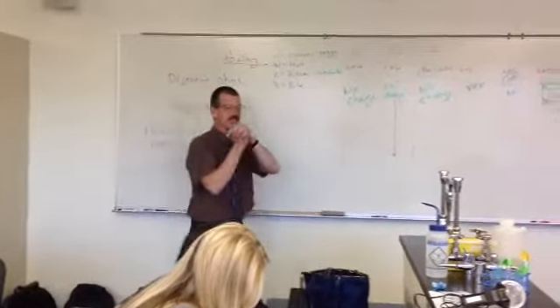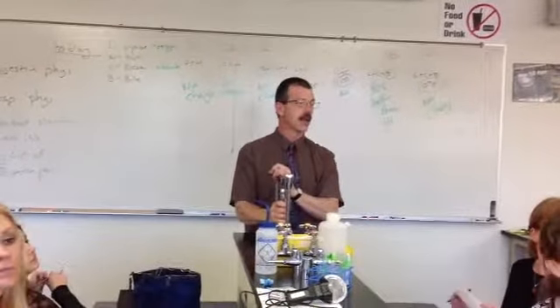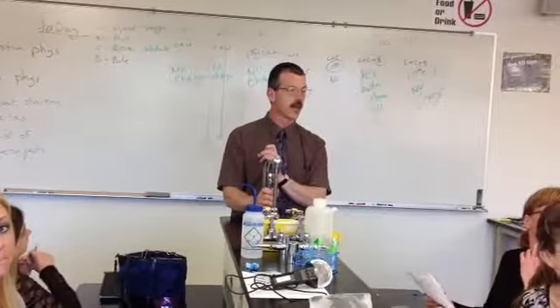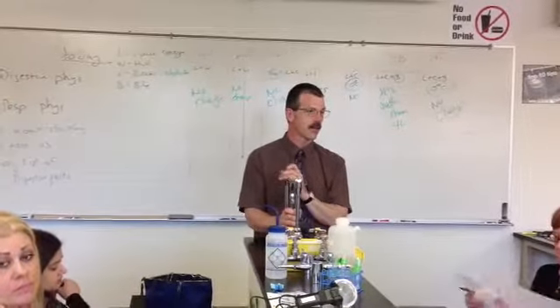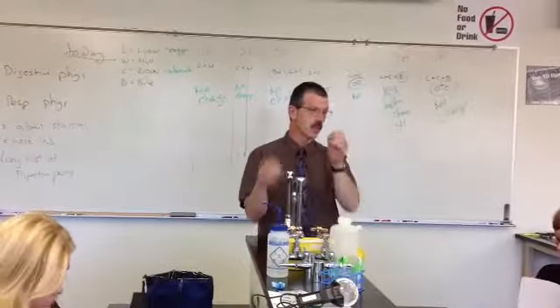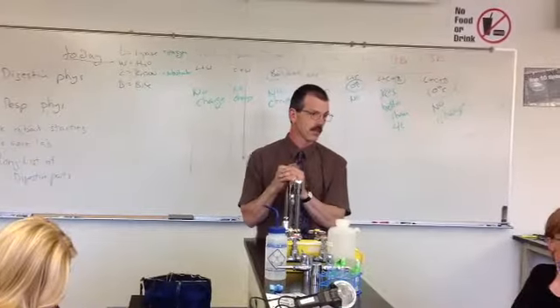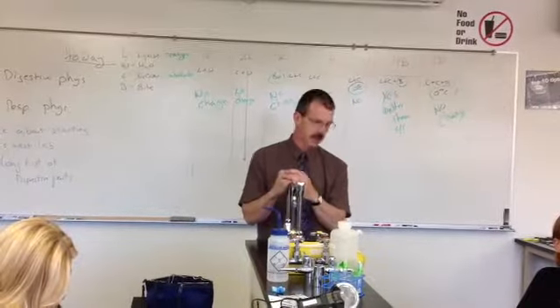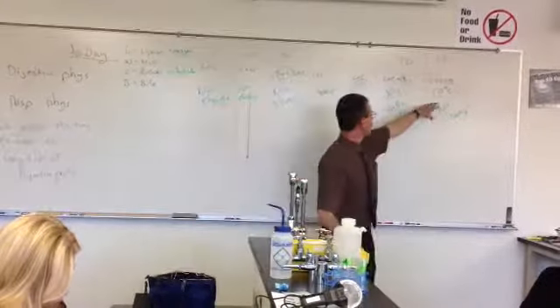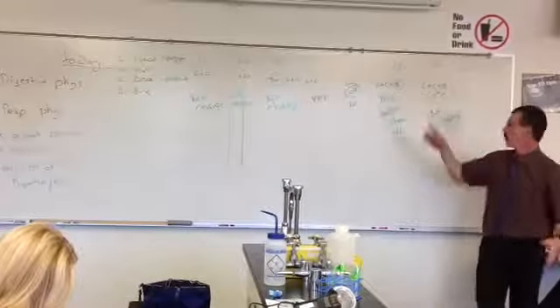Okay. I just wanted to reiterate something. So if you have an enzyme plus a substrate, you're going to get a reaction regardless, unless it's been boiled or frozen. Correct. That is the party line. Add the bile salt, the reaction's going to happen faster. It should be, because soap would break it up first, the enzyme can eat it better. If it's frozen and you add the bile salt, it should do nothing. Because the bile would work at 0 temperature, but the lipase wouldn't work at 0. So even though I broke it up, the enzyme won't go.